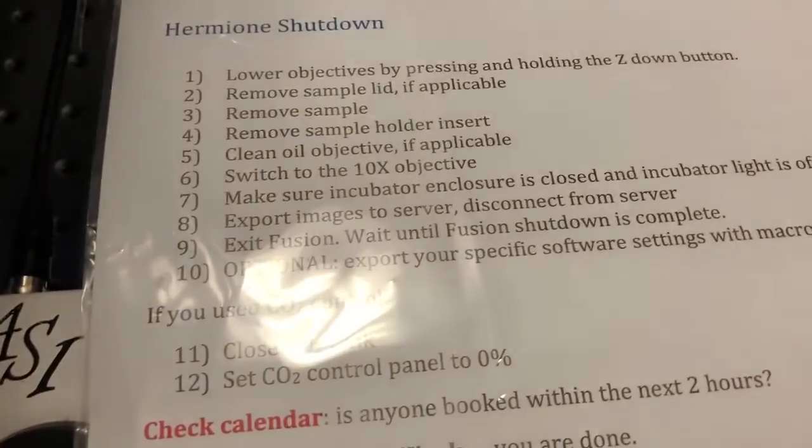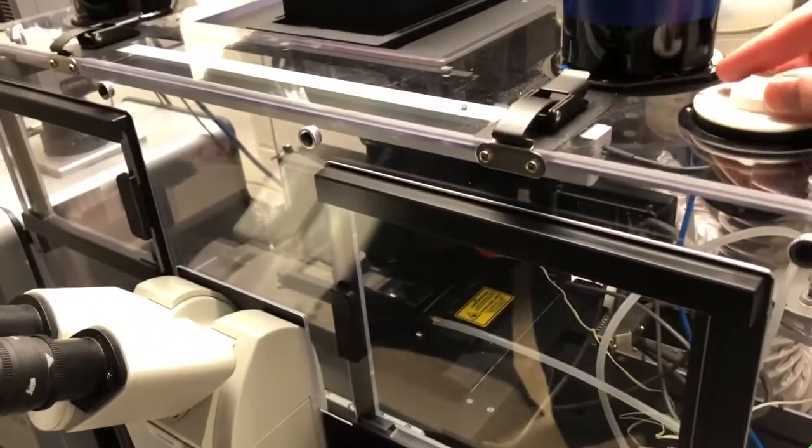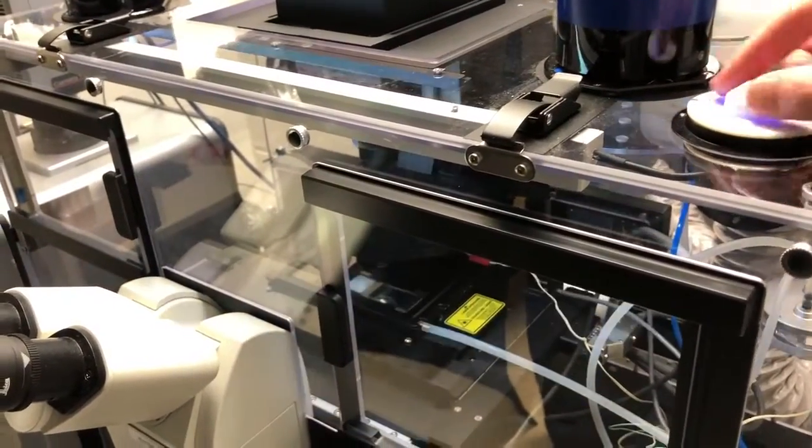The next step, step two, is to remove the sample lid if applicable. To do that we need to open up this enclosure and turn on the light so we can see what we're doing. The light can be turned on here, and then we can open the enclosure.